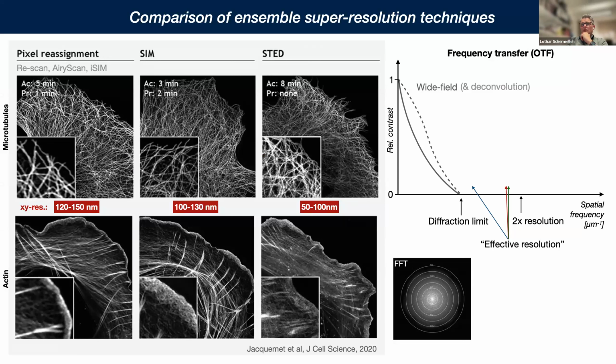if you look more closely at different structures, it's quite interesting to note a couple of things. For instance, the difference between Airyscan and SIM is probably more than you would guess from the numbers these techniques are advertised for.